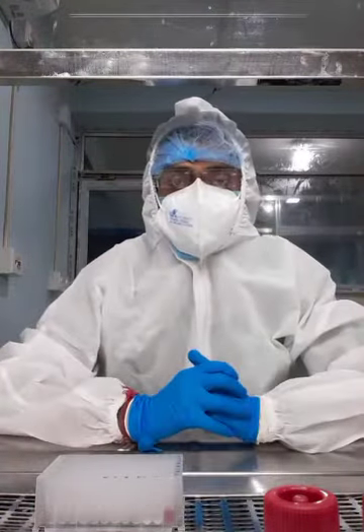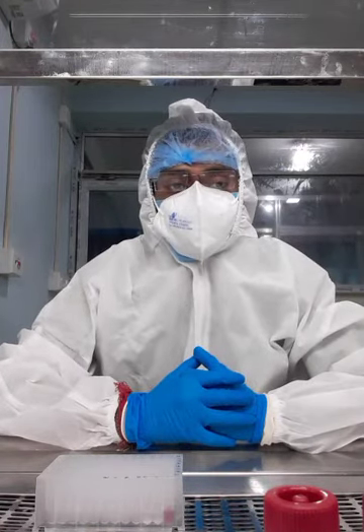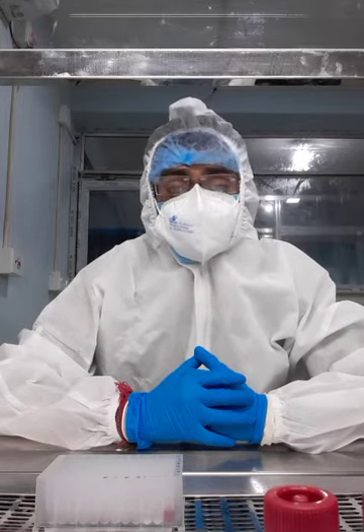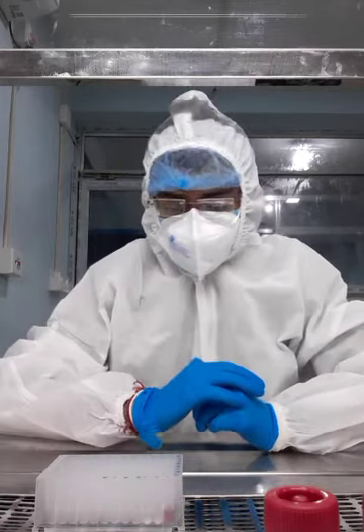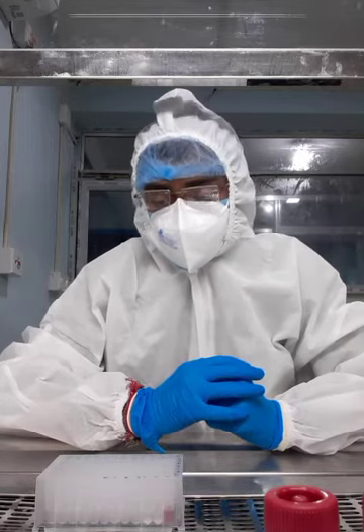I am showing the video to you. That's why I am not using the face shield, but a face shield is a must. Otherwise, there is a chance of infection. There is a chance of spreading infection towards you.